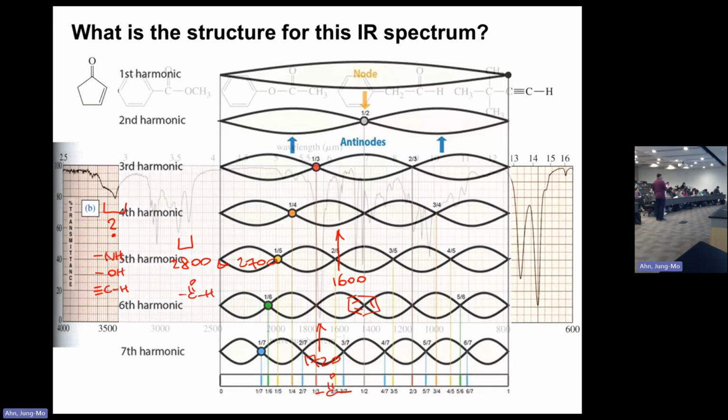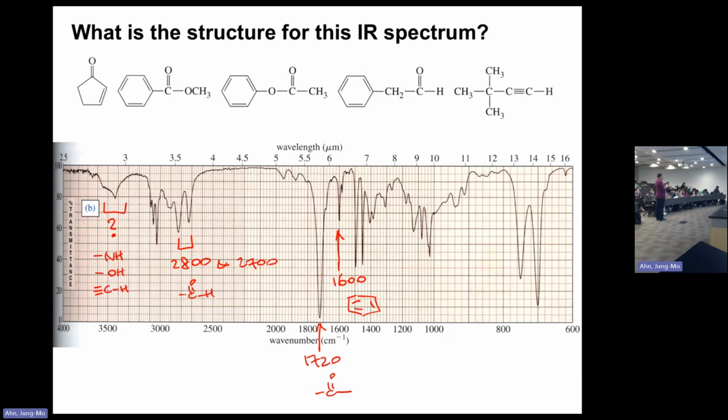If you play a single note, this huge signal makes a little bit of an overtone showing up in the spectrum. So this does not belong to the amine. This belongs to the strong carbonyl's first harmonic, second harmonic. When you see the strong carbonyl there at 1720, if you double it up, it's 3400, maybe 3450. I don't know exactly what the number is, but this is caused by the strong carbonyl signal. If you see this without the carbonyl, you may have to suspect it could be an amine. But if you see it with the carbonyl, then this might be just an overtone coming from the carbonyl stretching signal. So that's something you've got to be careful about.